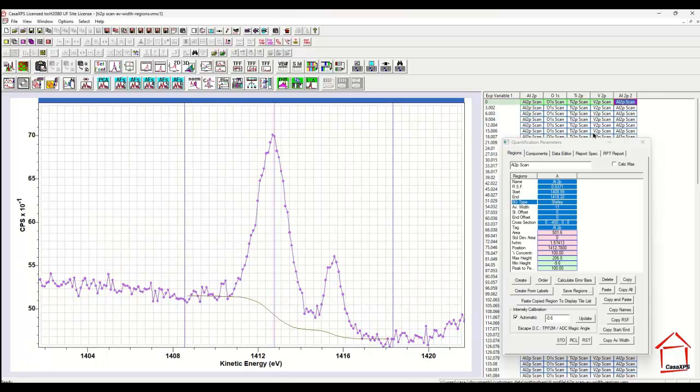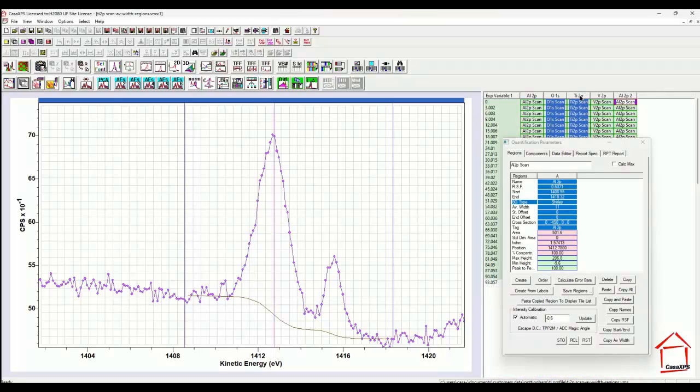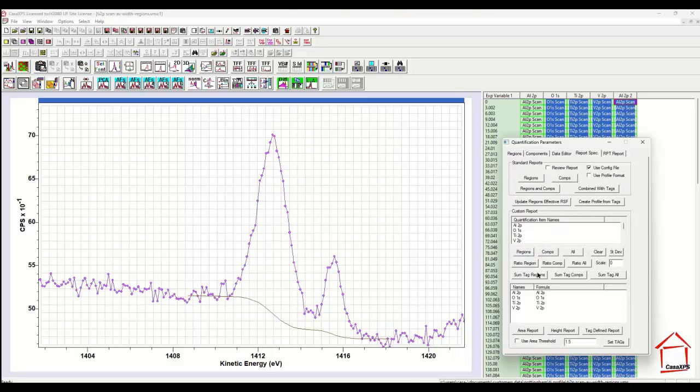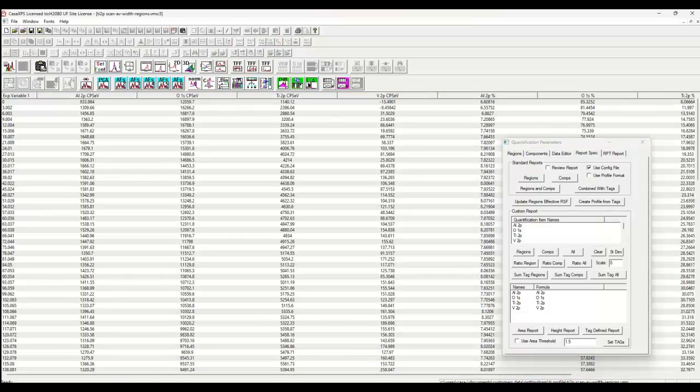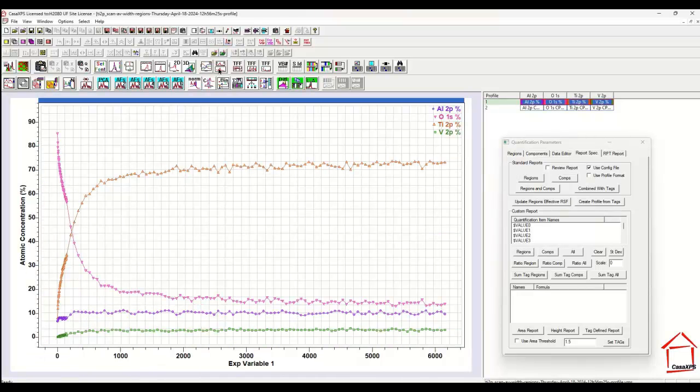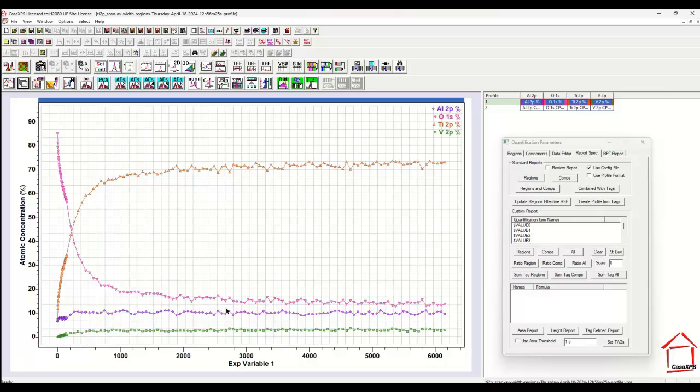So I've produced now a set of spectra that are noise reduced and instead of using the raw data, I'm going to use the process data to calculate the profile. The same region names will be used and I've selected the aluminium that is processed together with the oxygen, titanium and vanadium as we had previously. And let's calculate a profile once again. And the profile now we see is significantly improved in terms of the signal to noise variations within the aluminium.